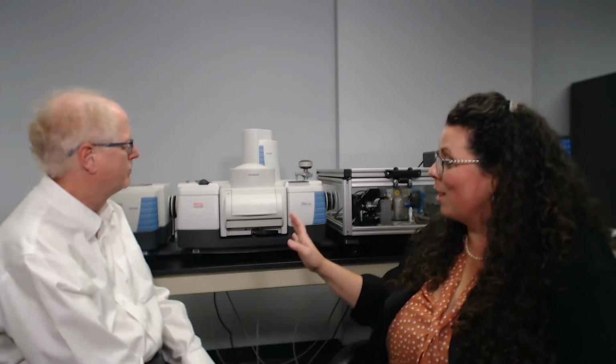Also, it might be a good time to talk about the hyphenated experiments that are supported. So another sample compartment accessory as well as an external module, right? We have as a sample compartment accessory that you can use the TGA-IR, which is thermogravimetric analysis, infrared. In that case, you have a TGA, which heats the sample up.